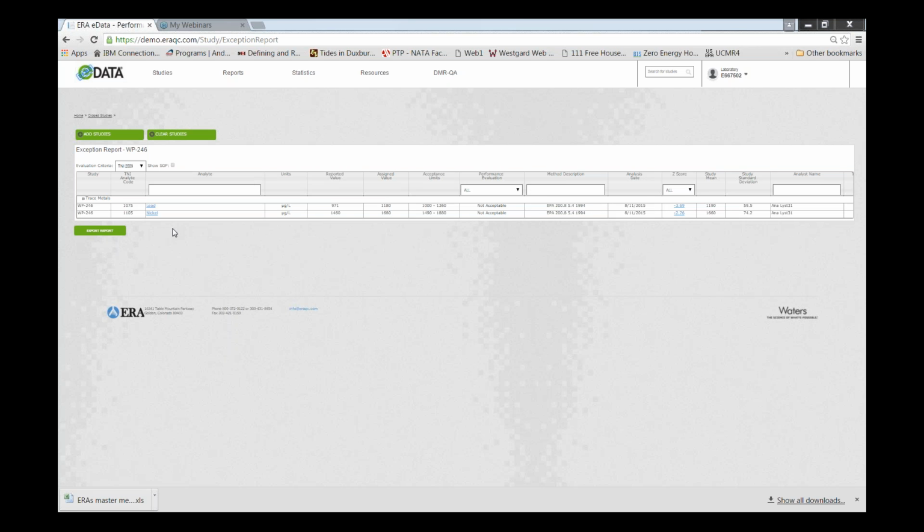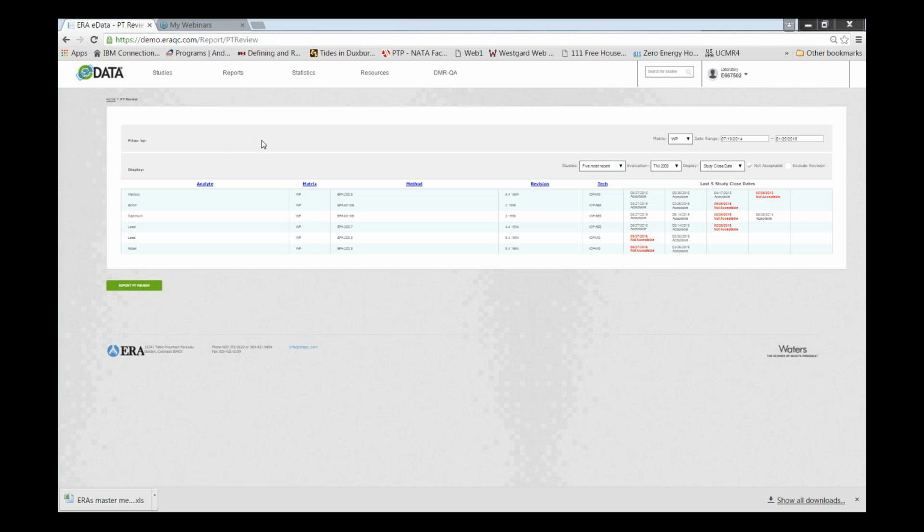Now nickel I'm not quite as concerned about, but lead I know that the last time around we had a not acceptable result there, so I'm a little bit concerned about my accreditation. And the next place that we're going to go to check that out is our PT review report. So I'm going to go up to reports, click on PT review, and here's our PT review.